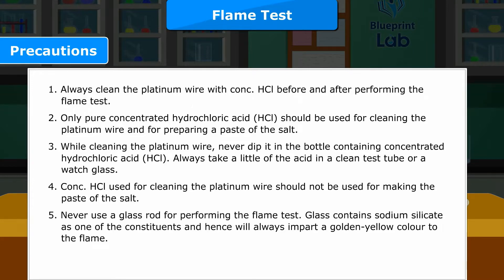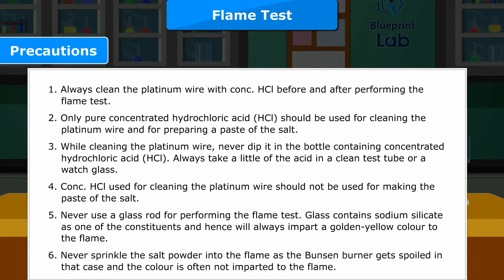Precaution 5: Never use a glass rod for performing the flame test, as glass contains sodium silicate as one of its constituents and will always impart a golden yellow color to the flame. Precaution 6: Never sprinkle the salt powder into the flame, as the Bunsen burner may get spoiled and the color is often not imparted to the flame.